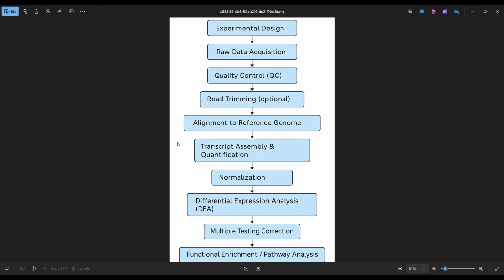And obviously, this whole tutorial and lecture series is only for those biologists who cannot use programming. So I'm not going into how you compare with the reference genome, how you download it, and how you make an input file for the reference genome and compare it with the raw files you have. We will skip that for now.